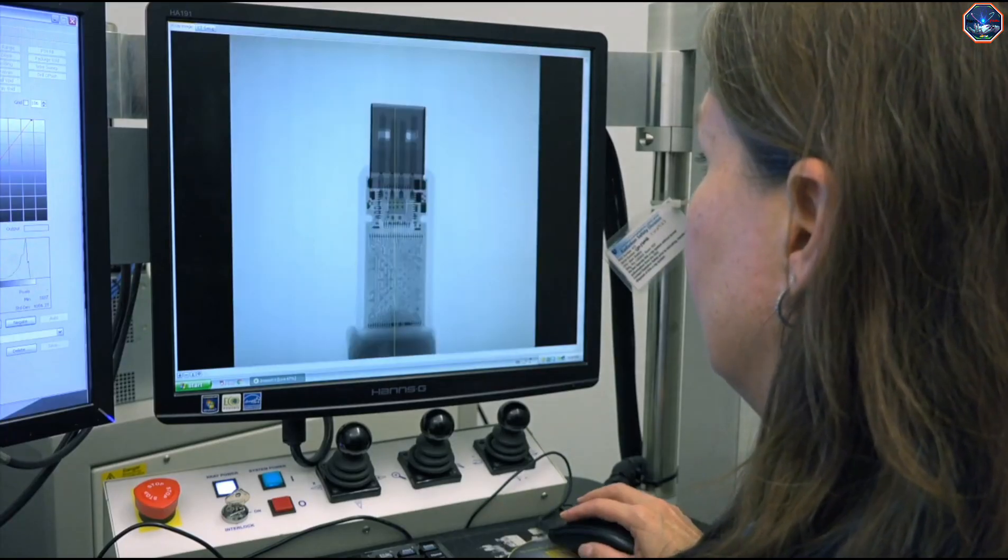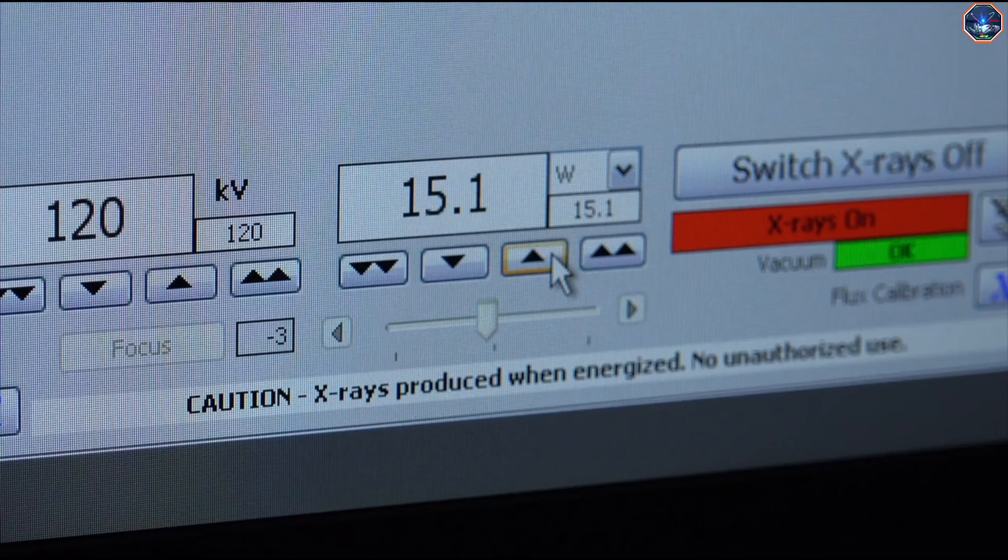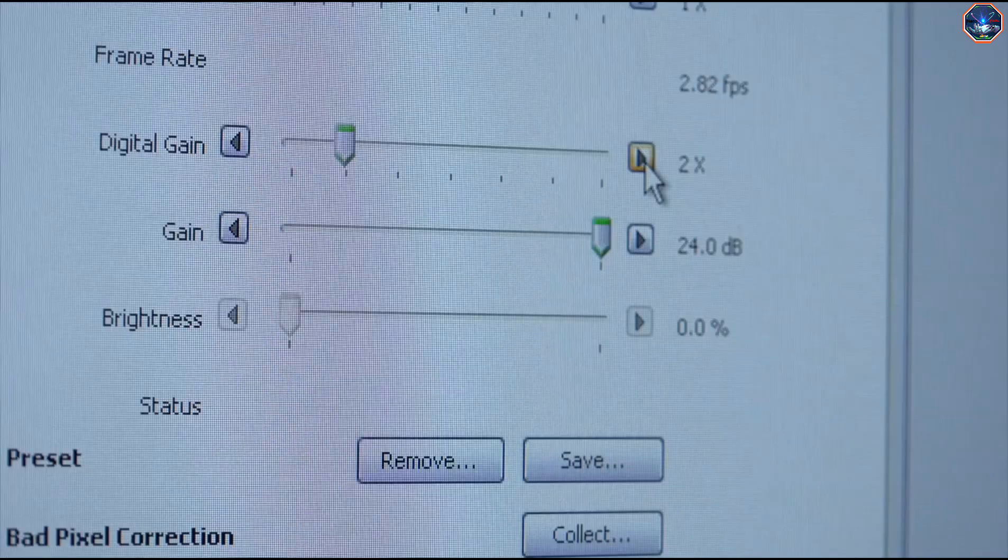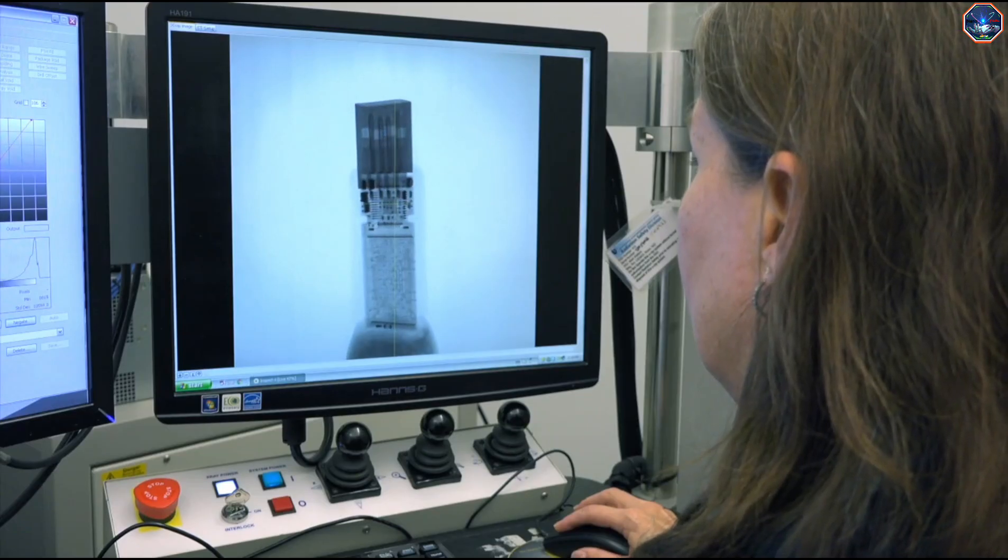Once we have a sample positioned on the stage, we can go into the software to adjust the x-ray energy, the exposure time, and the sensitivity of the signal to get the best image possible.